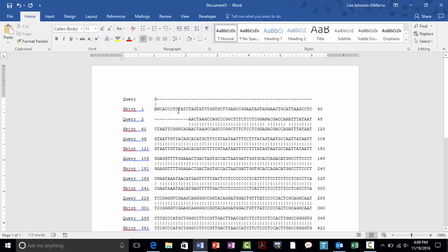And so what I'll go through is I'll go through and highlight each line of that sequence. And so I suggest you make the same decision, the same choice, and go ahead and highlight yours. I'll see you when you get done with that.